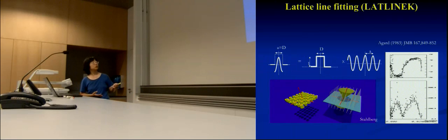It came from the fact that if you have a repeating unit in all 3 dimensions, you will get discrete spots in Fourier space. But because we don't have a repeat in the 3rd direction, the z direction, instead of discrete points like what we get in the xy direction, in the z star direction it's actually a continuous line, just like what you would get from a single particle.